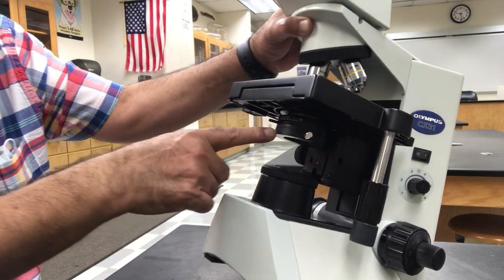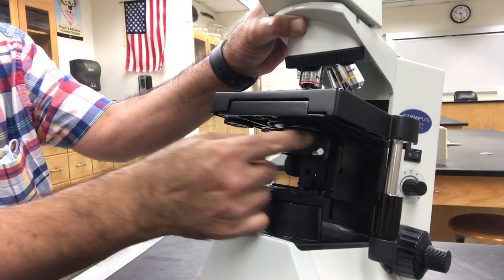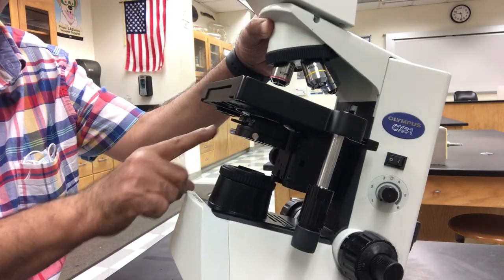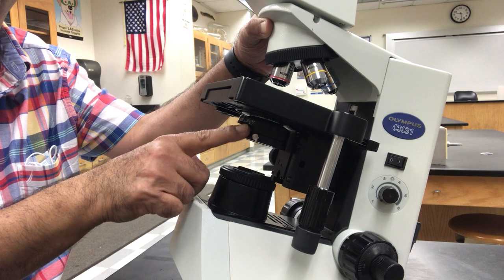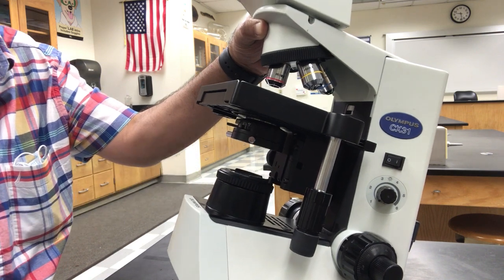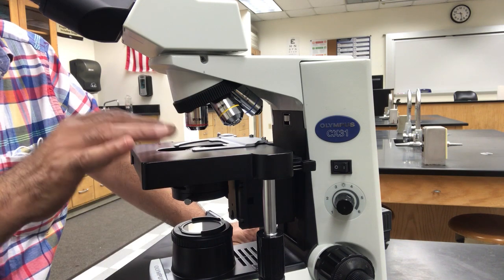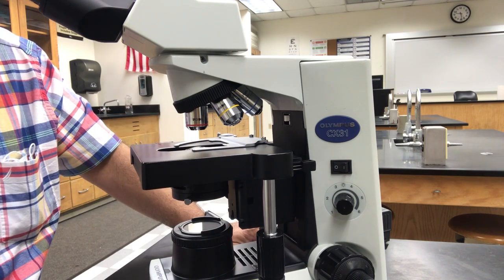And then in the condenser, you have this another movable piece. It's called the iris diaphragm. This thin, easily movable, black needle-like structure. This one controls how much light will come through the microscope.